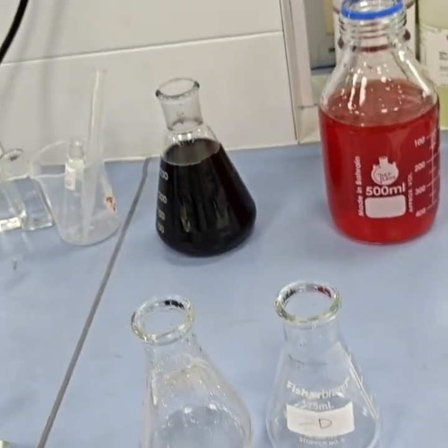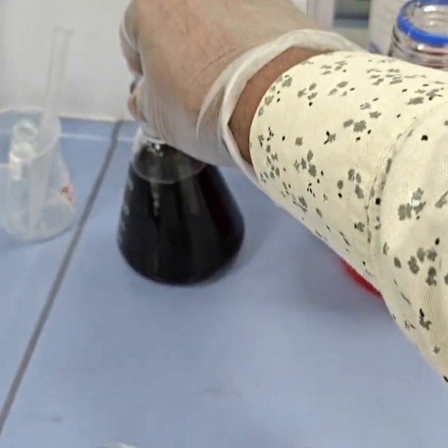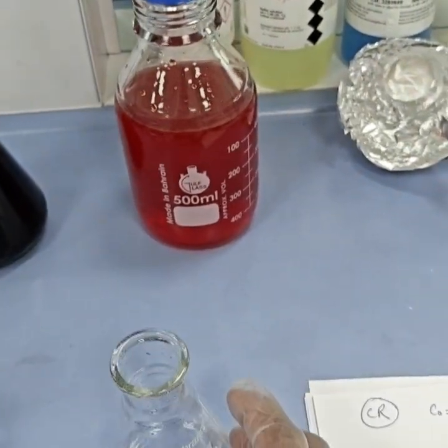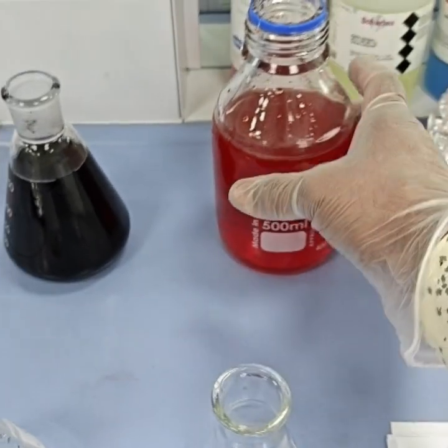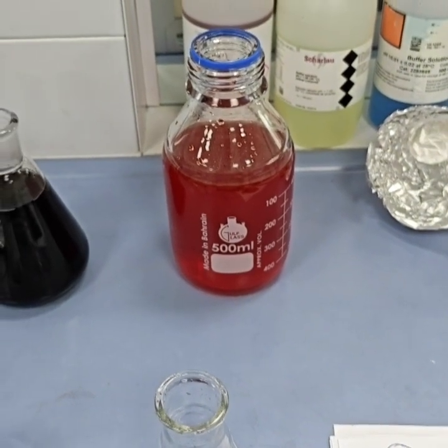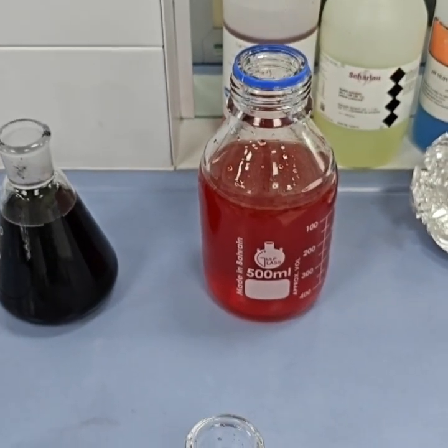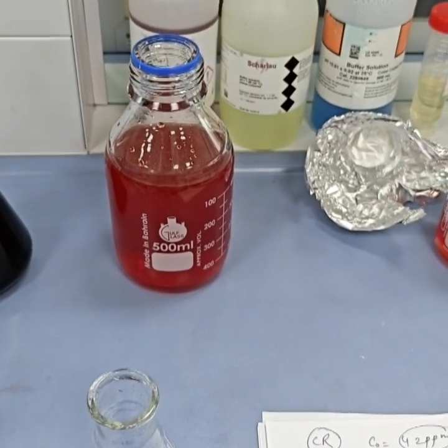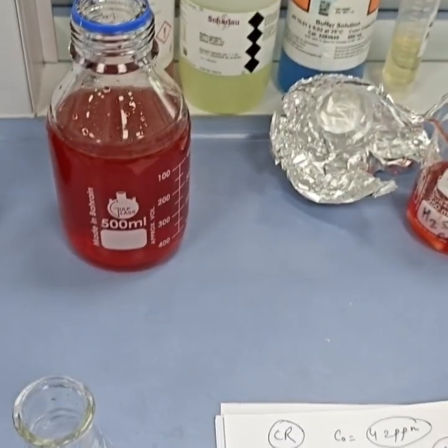For example, in front of us we have the Congo red dye, and this is Eriochrome Black T. These both are anionic dyes, and we all know the applications of dyes. Usually dyes are used in textile industries and paper industries for coloring. We also know about the toxicity levels of dyes, at what extent they could cause damage to human beings, plants, animal species, or marine species, and the pros and cons of using dyes above the permissible limits.